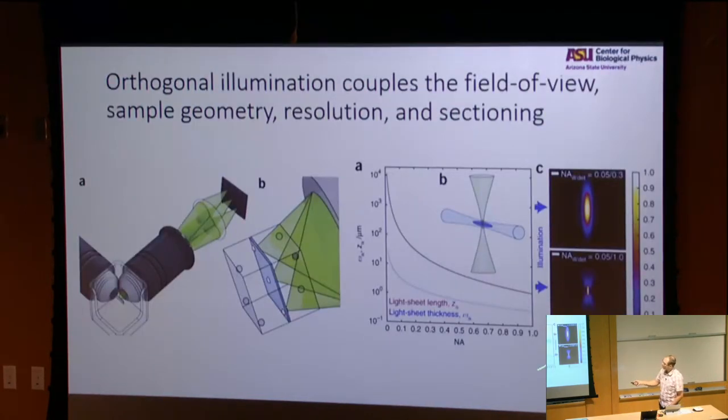So people eventually adapted this idea to fluorescence. The idea is you bring a fluorescence beam in, you illuminate only a few fluorophores, these emit, and then you have some convolution of your excitation beam and your detection beam, so this gives you optical sectioning. So instead of having a microscope with one objective, we turn it to two, and by doing this, we get rid of out-of-focus light because we're no longer illuminating the whole section. So we can hopefully go faster by imaging.